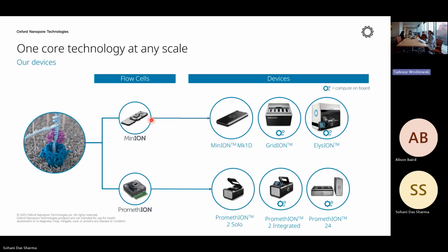There is another platform in terms of flow cell. It is called MinION. MinION can be used in the MK1D, and it just looks like a cell phone. I thought of bringing it today, but I forgot it at home. You can just take it anywhere. I think it is very useful for all the groups doing field work in many secluded regions. We even have projects with NASA, where they do the sequencing when they're going out of space, because it's so user friendly.